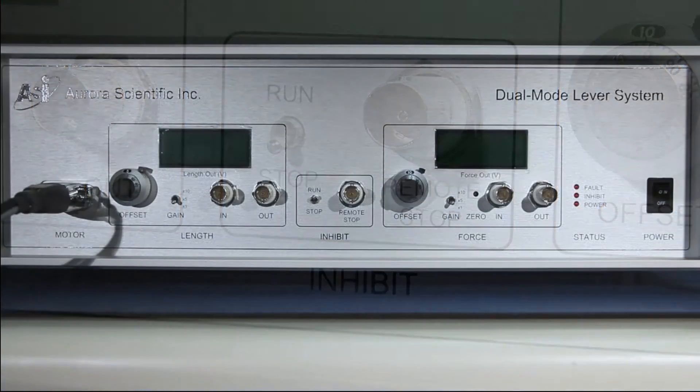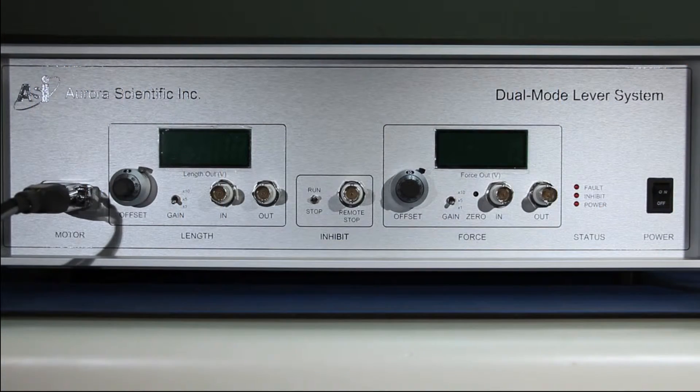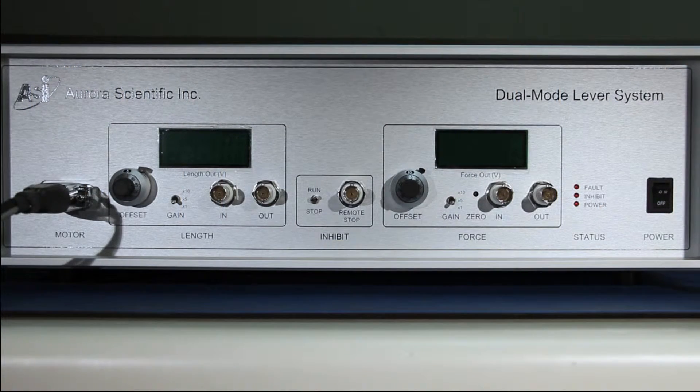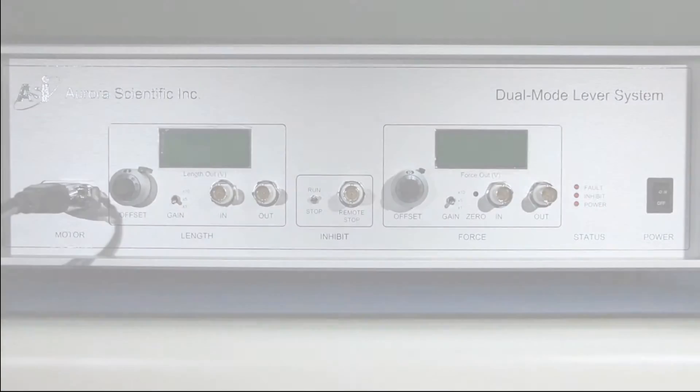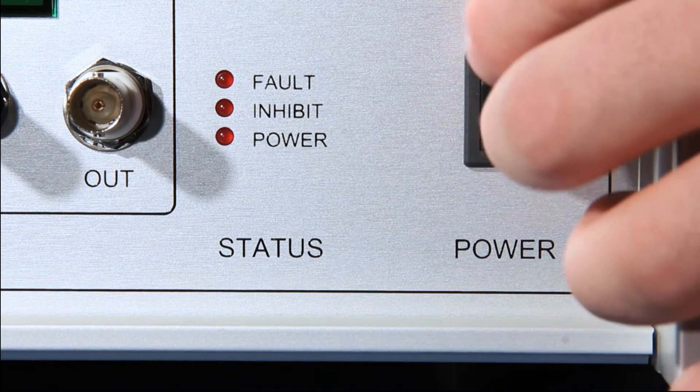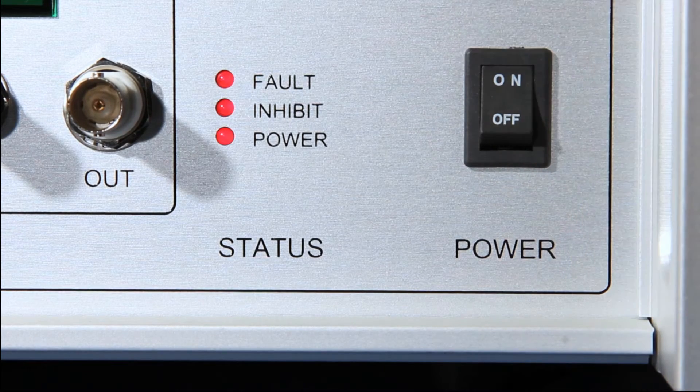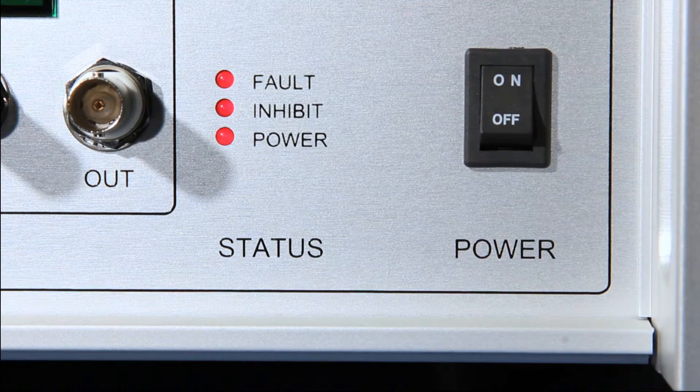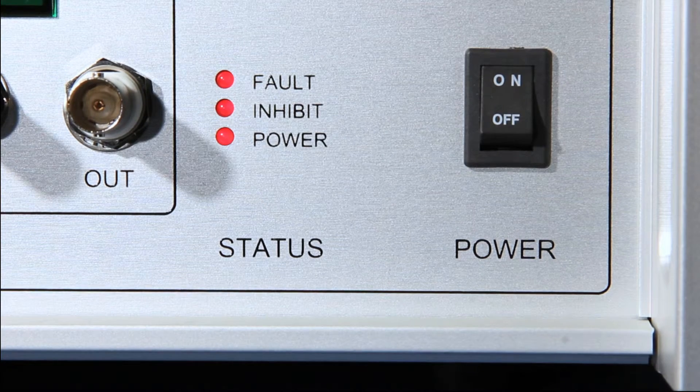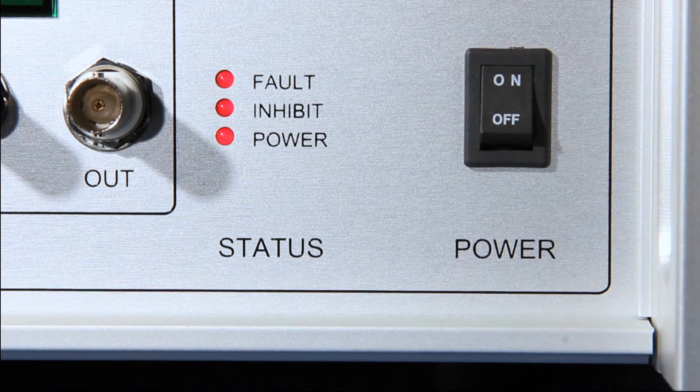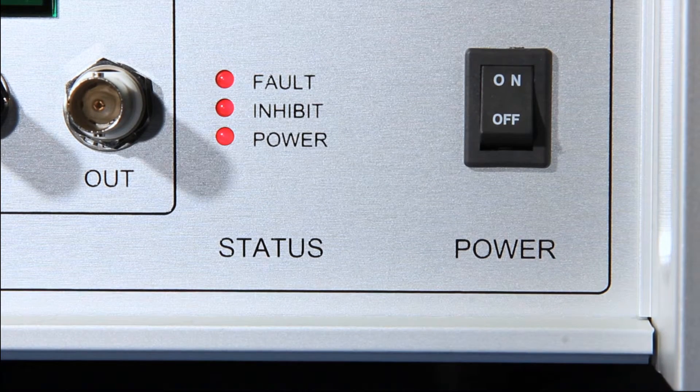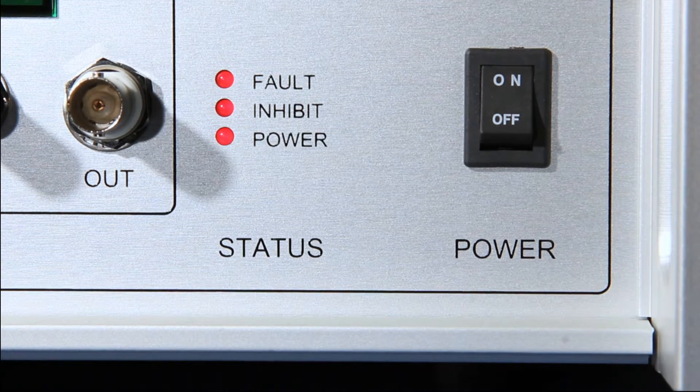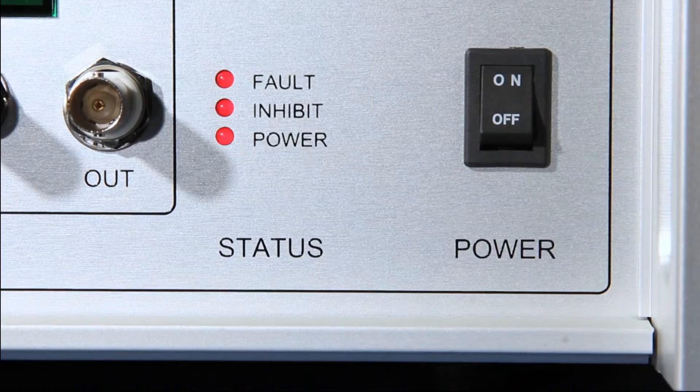Now we are ready to turn the unit on. Flip the front panel switch on. All status indicator lights to the left of the power switch should be glowing red.